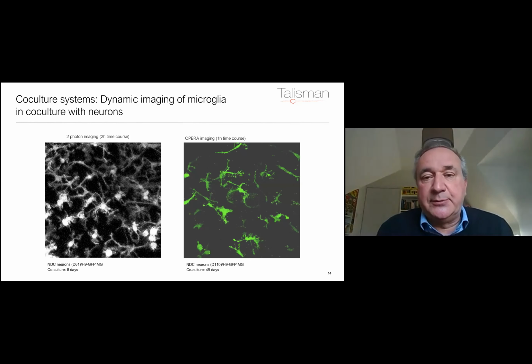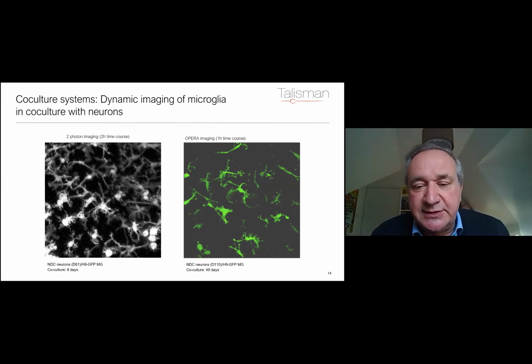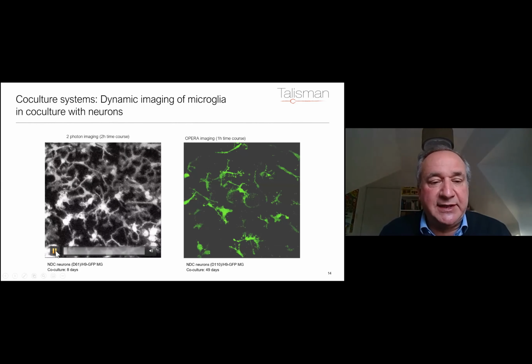Here we're using an Opera system. It's an Opera Phoenix system that allows us to image these. And what this allows us to do is to demonstrate that they can be co-cultured for up to, in this case, 49 days. And again, the images that are seen are highly characteristic. So I'll just show you those two videos now.